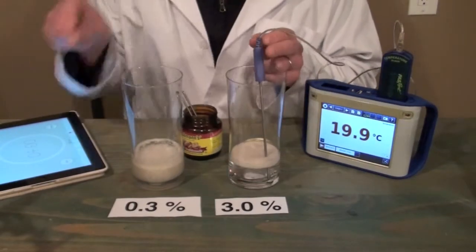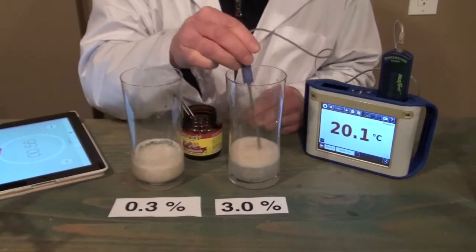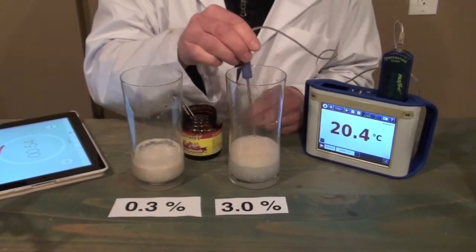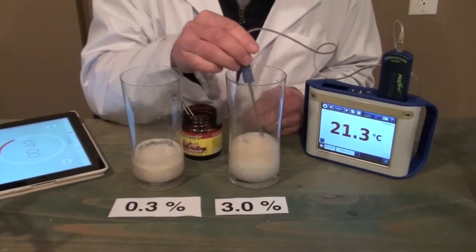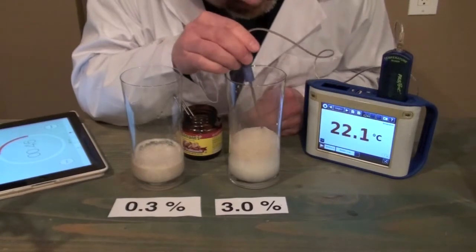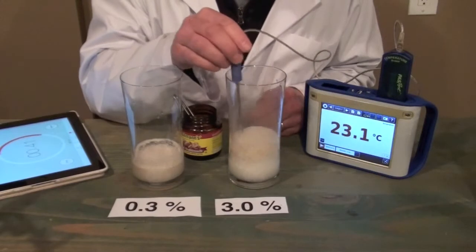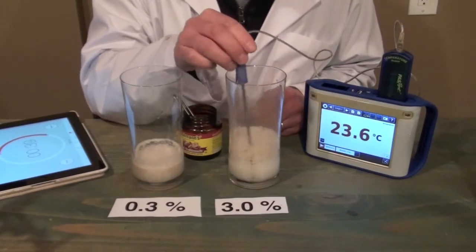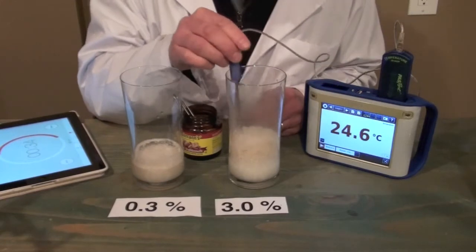And we'll start our timer. Now we can see right off the bat that even after 5 seconds we've already got a centimeter of bubbling. And the bubbling is a lot more violent. Just going to continue to gently stir like we did before.